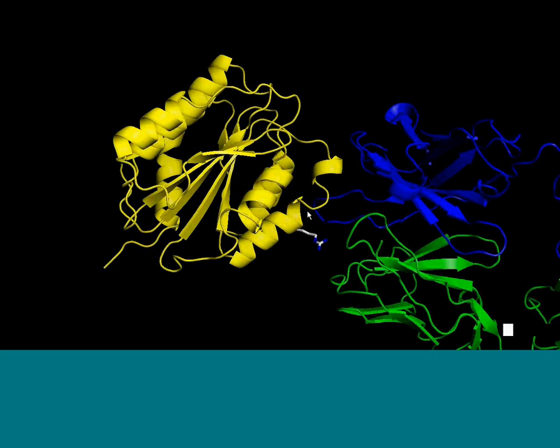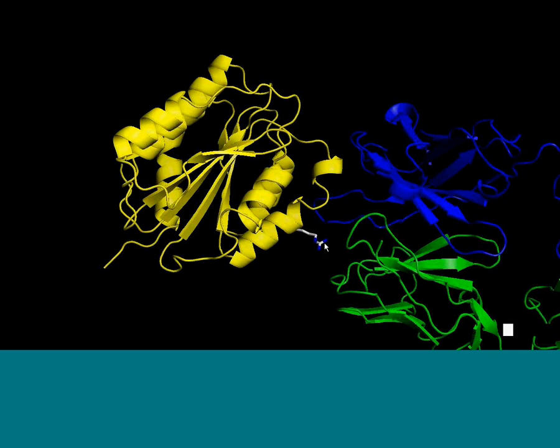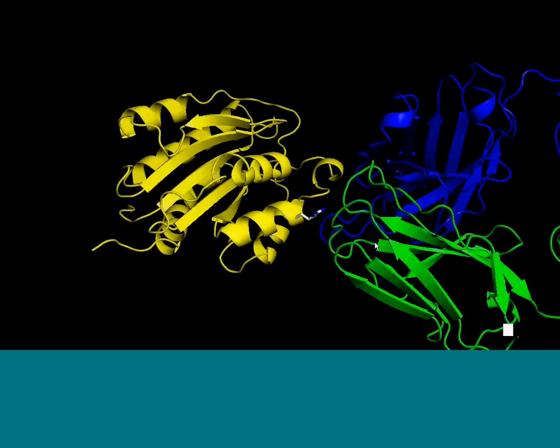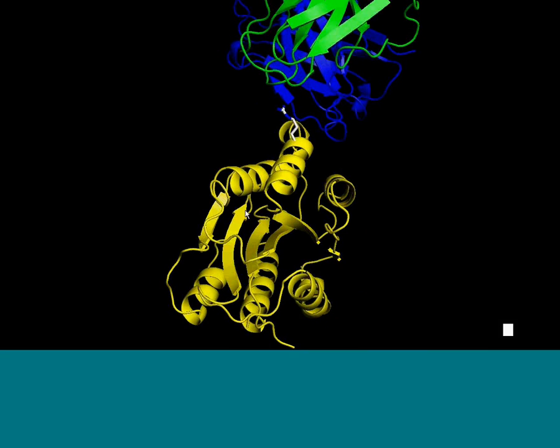But we're currently working on some other monoclonals against this domain to really confirm what we're assuming here, and that is that if this, for example, mutated to alanine causes destabilization, it should affect the binding of an antibody that binds elsewhere but in proximity to the molecule. So that's something that, again, we want to be able to do in a multiplex format if we're looking at multiple antibodies binding to particular mutants, that we could do in the Proteon. We could conceivably look at 5 or 6 different antibodies binding simultaneously on one run.